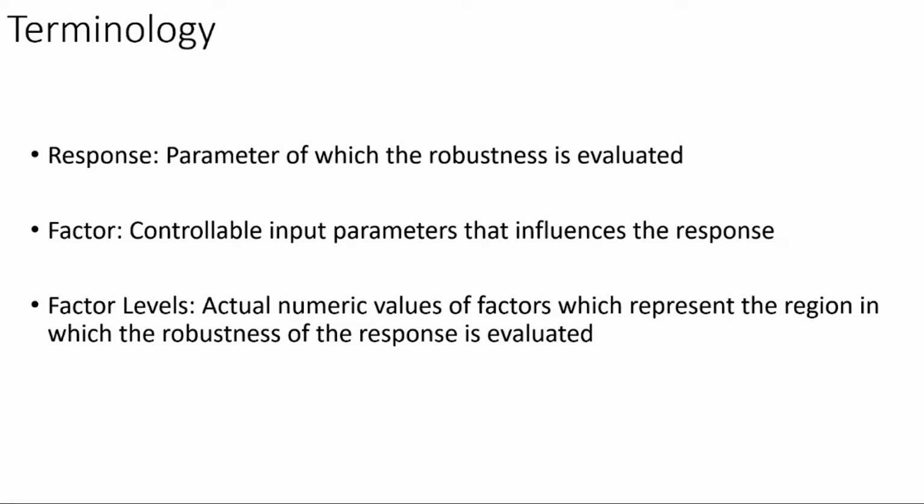Additionally, we need to understand that there are factors. These are the controllable input parameters that influence our response. In our example we have three of them, namely the pH value, the additive concentration, and the column temperature.